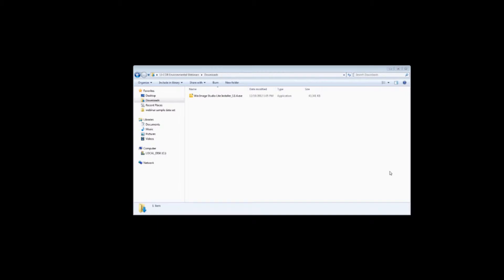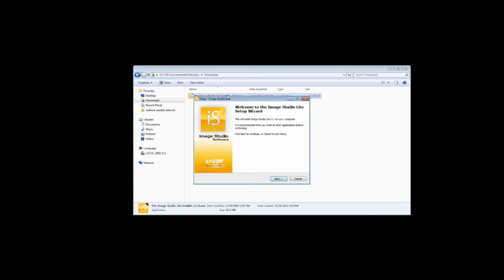The ImageStudio Lite installer should launch automatically after you download the file. If it doesn't, navigate to your downloads list and double-click the installer in that list.